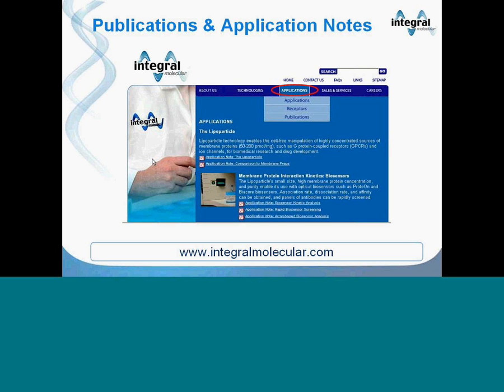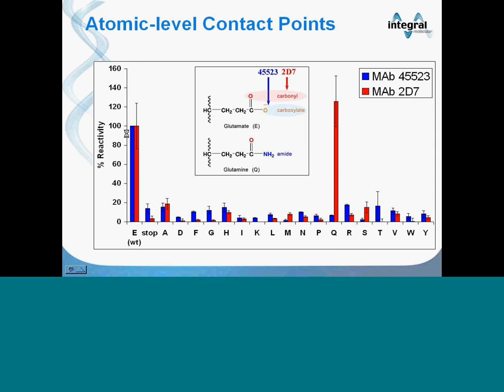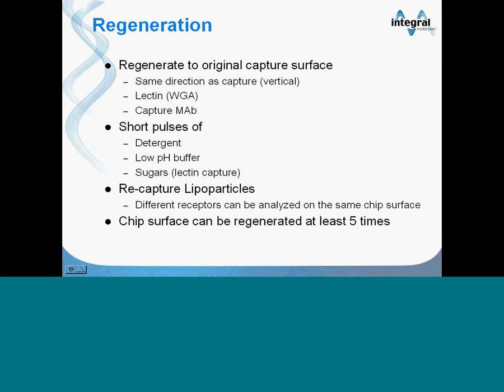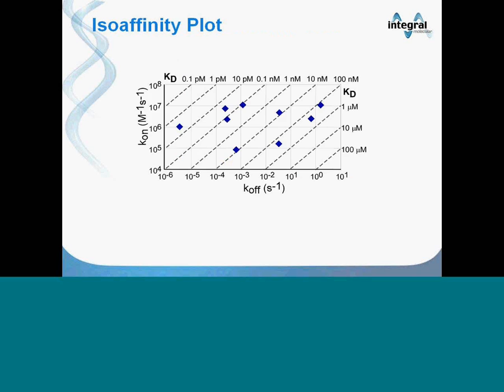Hi, I've got a question. You mentioned that you could directly couple the nanoparticles, but you didn't then show any. What kind of RU levels do you get with amine coupling? Right. With amine coupling, we can get similar RU levels, 3,000 to 4,000 RUs immobilized typically.